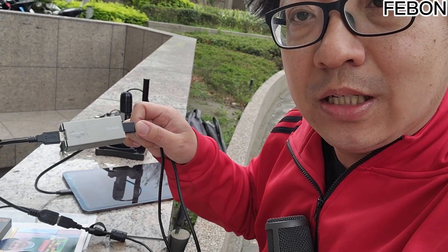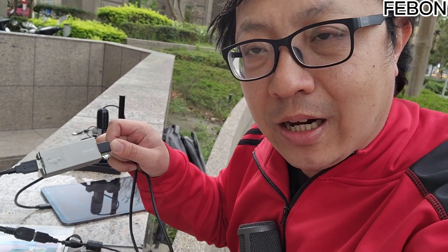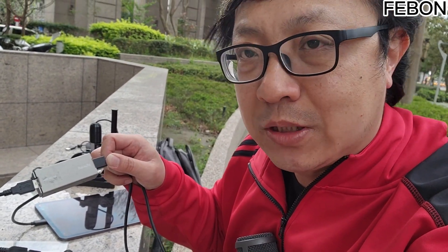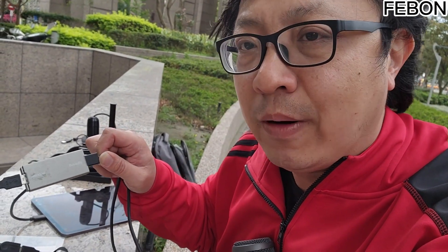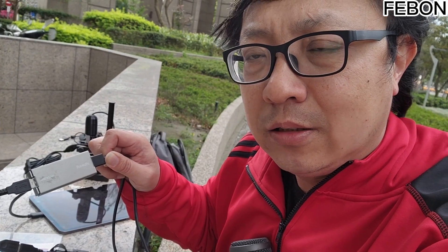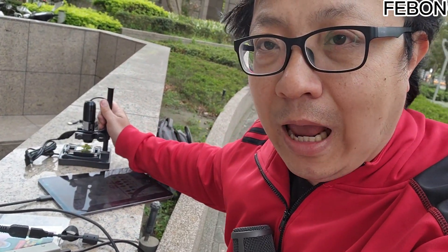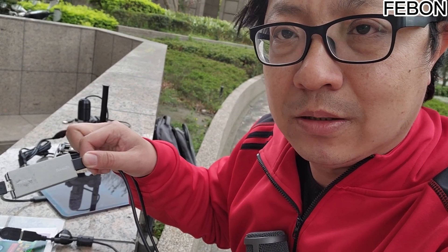This is an economical solution. What is economical about it? It can only record video and take pictures, and there is only image — there is no sound. So it can't do live broadcast. It is just that your iPad or iPhone is simply treated as a screen. It is impossible to do live broadcasting. Of course, it is the easiest way to use these USB cameras or USB microscopes on the iPad and iPhone outdoors. This is the first solution.